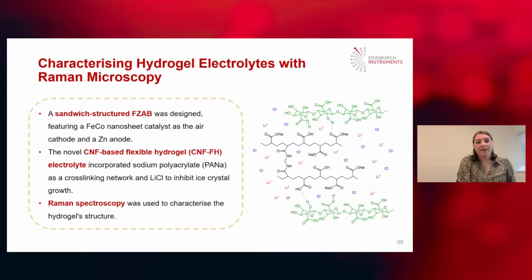Just a bit of background about the specific battery. They looked at a sandwich-structured flexible zinc-air battery, which had an iron-cobalt nanosheet catalyst as the air electrode and a zinc anode. As I mentioned, they were using this novel CNF-based flexible hydrogel electrolyte, and this incorporated sodium polyacrylate as a cross-linking network, and also lithium chloride, which they were hoping to use to inhibit ice crystal growth. They then used Raman to characterize their hydrogel, but also to have an idea of the performance of the hydrogel as well.